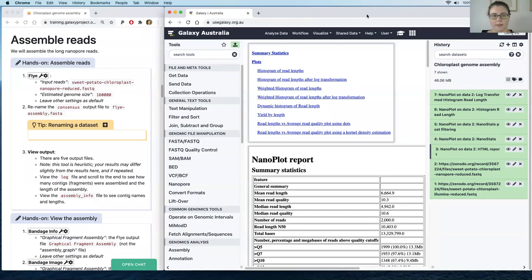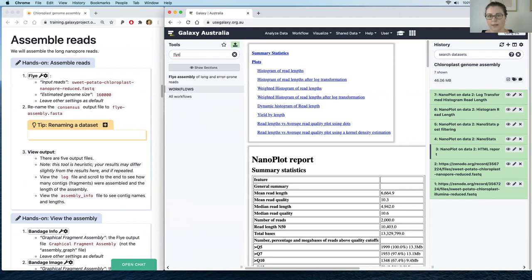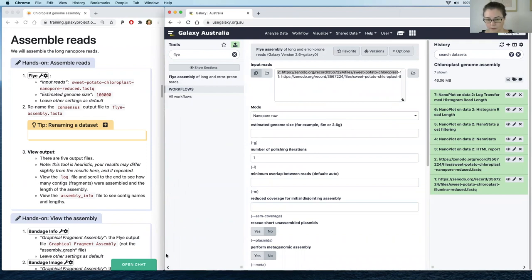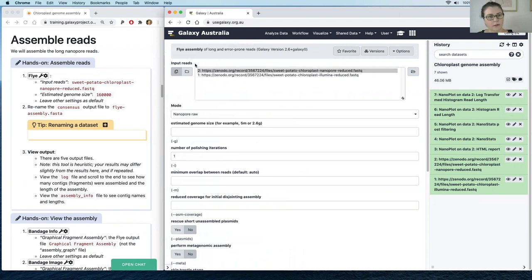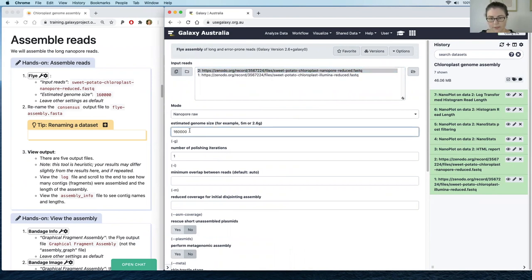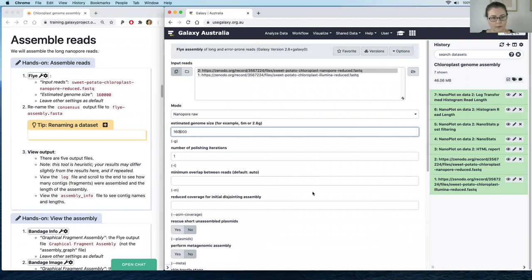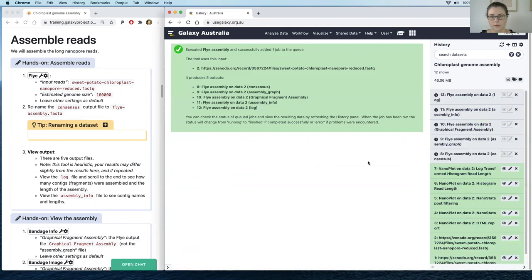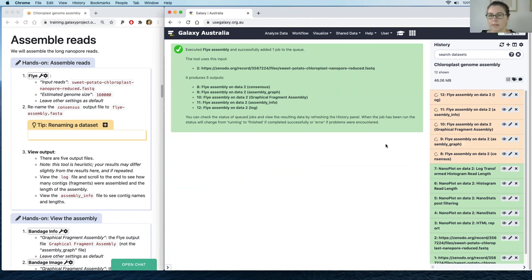Now let's assemble our reads. We're going to assemble the long reads — the Nanopore reads — and to do that we'll use a tool called Flye. I'll type that into the tool panel and click on Flye, then collapse the side panel so I can see a bit better. We want to give it the Nanopore reads as input, give it an estimated genome size of 160,000 base pairs, and click Execute. Flye may take five to fifteen minutes to run depending on the queue in Galaxy.